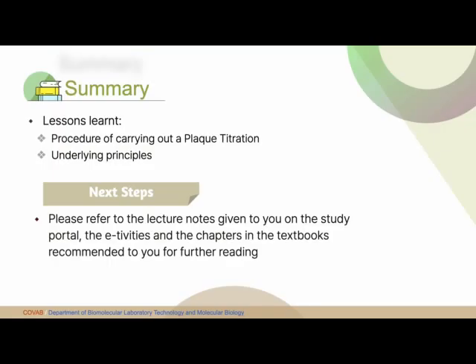So in summary, the lessons learned so far: we've looked at the procedure for carrying out the plaque titration assay and the underlying principles. The next step: please refer to the lecture notes given to you on the study portal, the activities therein, the chapters in the textbooks, and the peer-reviewed journals that we have recommended for further reading.